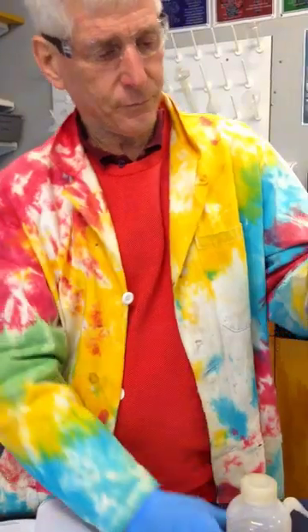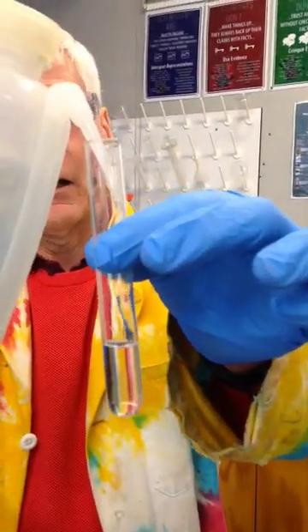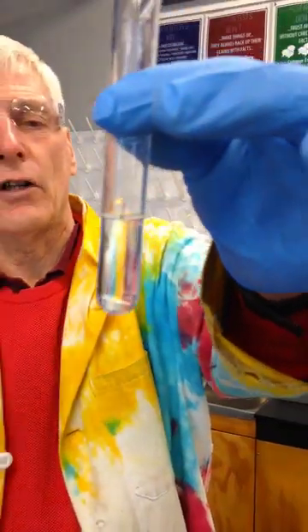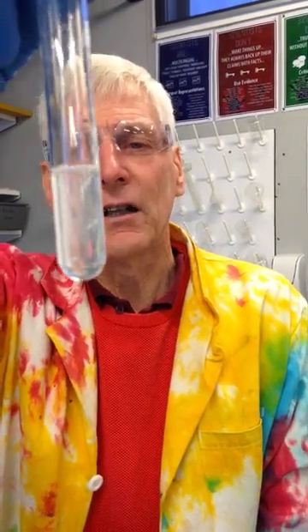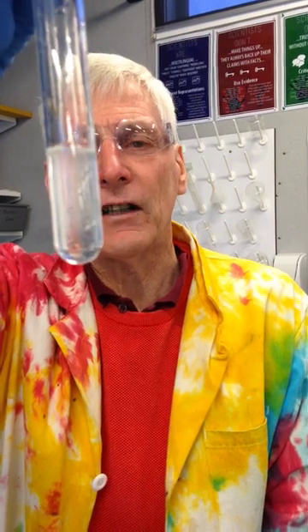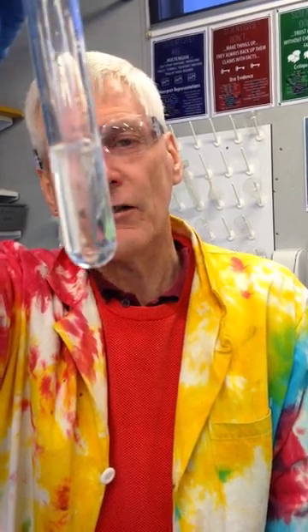If I do the same for methanol, you'll see again no layers. Again, even distribution of solvent and solute molecules throughout, and they're evenly dispersed in each other. This is a true homogeneous mixture, which is the classification of a solution.